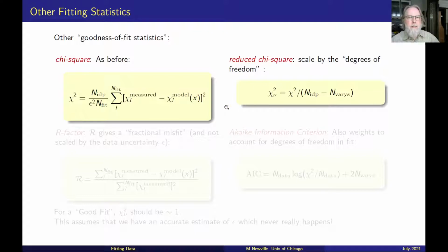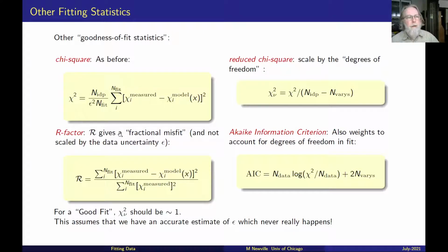We'll often find it slightly bigger than that, partly because we don't have a perfect estimate of epsilon, and partly because the model that we make with Feff calculations are not perfect. Those F and delta functions are good, but they're not perfect. In addition, because those statistics are somewhat questionable about whether they're really perfectly scaled, we have other goodness of fit statistics that we use as well.